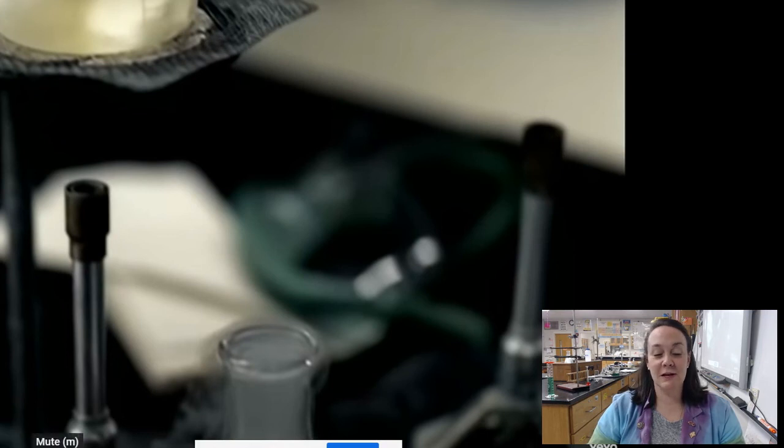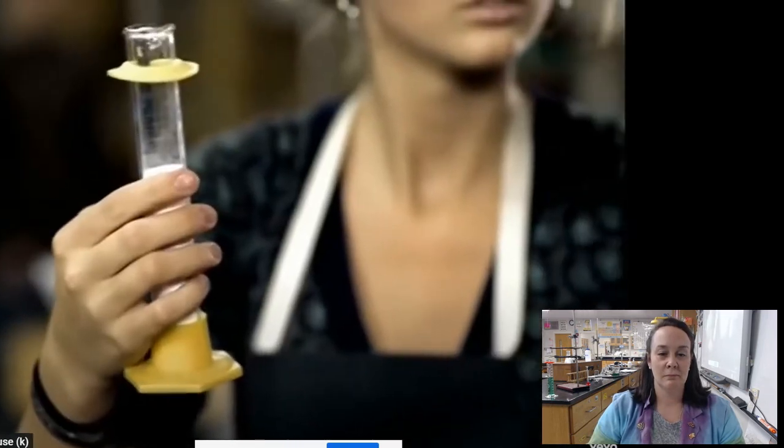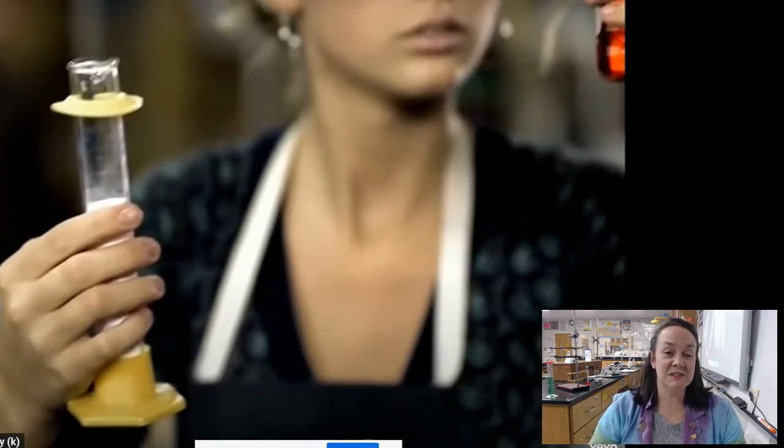The thing about this is that we do have a bubbling beaker, but it's over a not-lit Bunsen burner. Okay. So maybe some dry ice, maybe for effect, but there's no need to put it over a Bunsen burner that's not lit, but moving on. I could be just mis-seeing this, but she doesn't happen to have a solid in a graduated cylinder, does she? Because we know the graduated cylinders under measure liquids. You're not going to put a solid in here and then try to pour it all out and not expect that it wouldn't get stuck. And you don't measure volume of a solid. You measure a mass, so you would need a scale for that. But maybe I'm seeing things. I don't know.